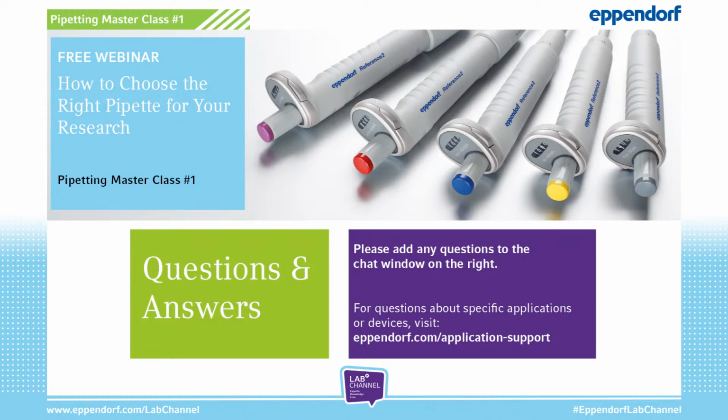So in general, you can do a so-called dripping test. Let's say for an air cushion pipette, you put your tip on your air cushion pipette. Let's say you have a 1,000 microliter pipette, so the nominal volume is 1,000 microliter.